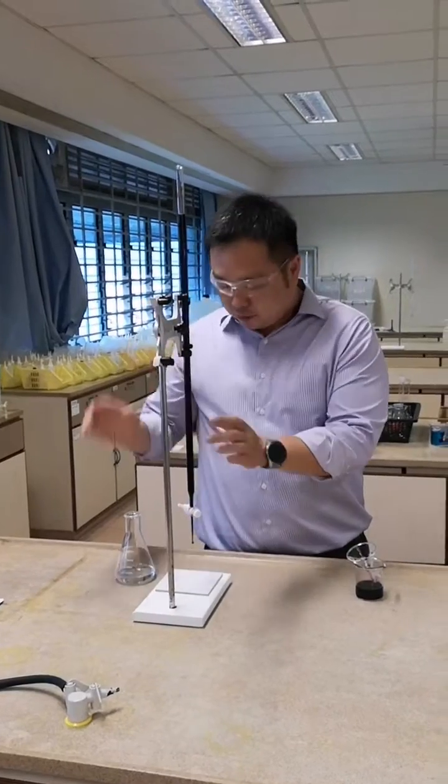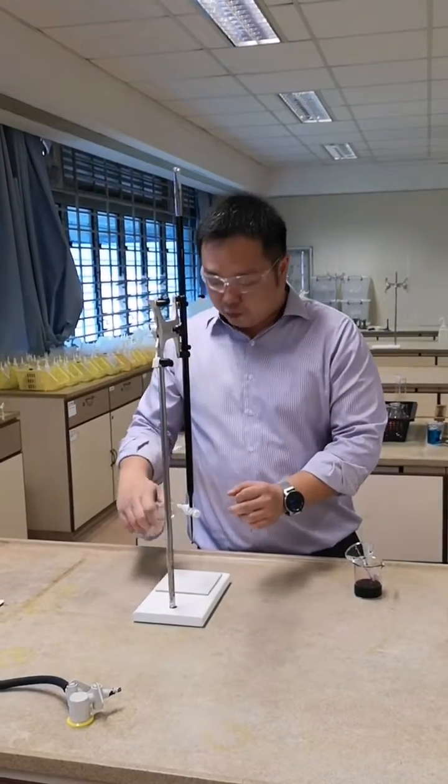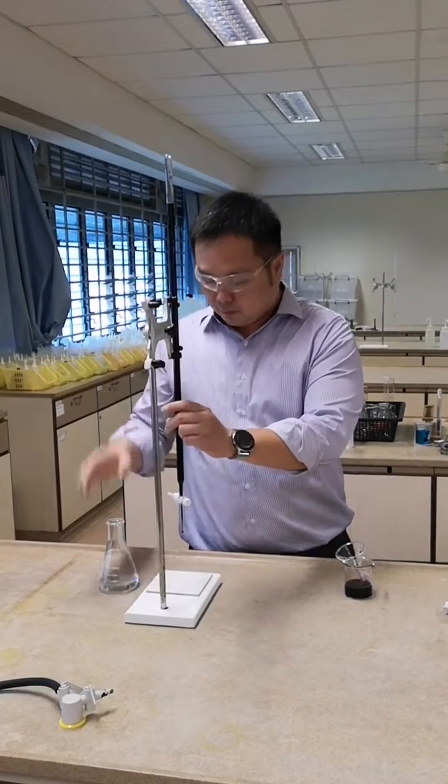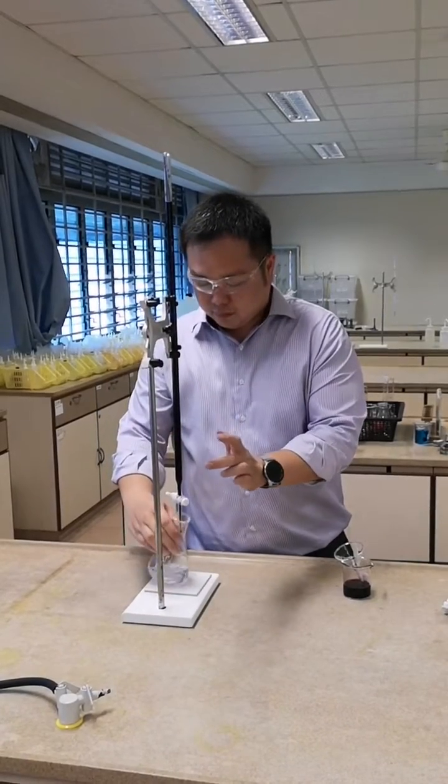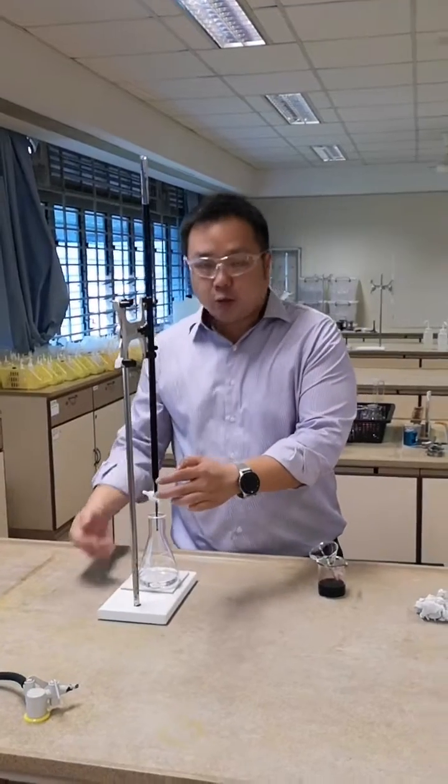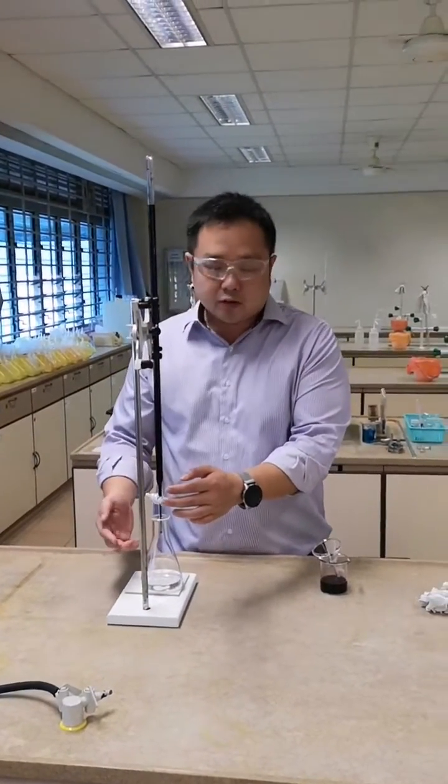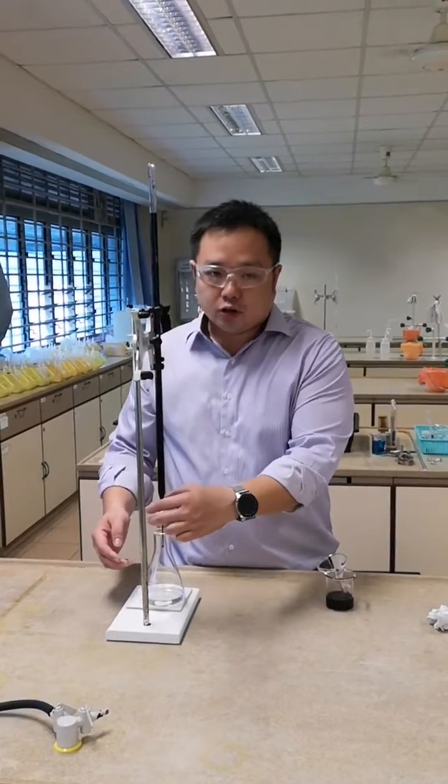Before you start the titration, reminder again to remove the filter funnel from the burette top. As a rule of thumb, it's best that you can swirl as you do the titration. It will be good if you can use your master hand to swirl and your non-master hand to control the tap.